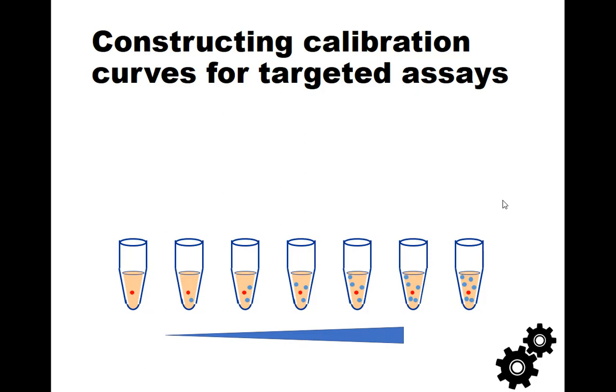For a calibration curve, yep, that's what you would do for SRM or PRM. You would run the same method you would normally do, and you would run each one of these samples, starting with the blank and moving up, not randomizing, which is exactly the opposite of what Olga just told you, right? Olga just told you, randomize, block everything. So you'll run from the blank up, and the reason for this is carryover of your synthetic standards. You want to avoid any carryover. So I'd run my blank, and then I'd run each one of these. And then maybe I would run a QC, and then I'd run my blank, each one of these, and do maybe triplicates for a curve like this. Any more questions before I switch gears?